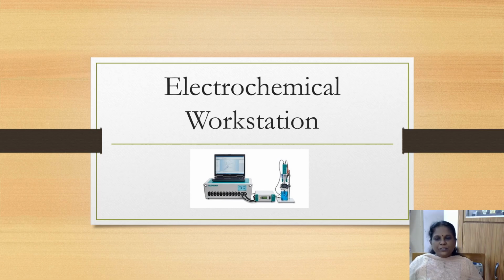Good morning, dear students. In this presentation, we are going to see about the electrochemical workstation, its components, working principle, applications, and modes of operation.